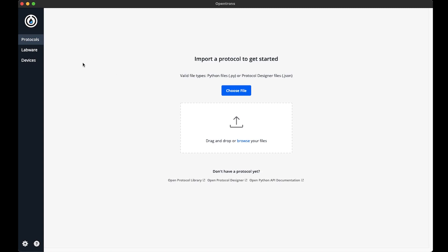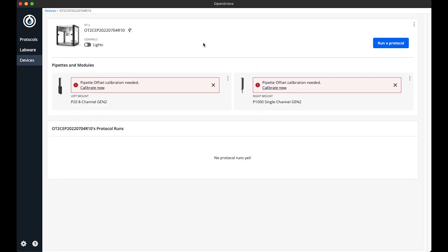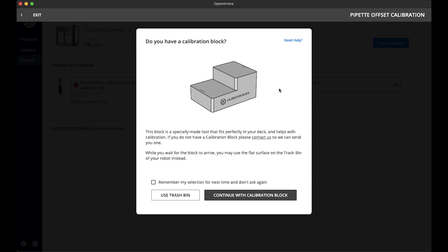To initiate this calibration, I will navigate to the Devices tab in the Opentrons app and select the device I want to calibrate. Since I haven't calibrated the pipette offset or tip length calibration yet, there is a banner asking me to do so. I will click Calibrate Now. When you first calibrate the tip length and pipette offset, the robot will ask if you want to use the calibration block. If you don't have one, you can use a trash can, but since I have a calibration block, I'm going to use that. I'll also click 'remember my selection for next time' and continue with the calibration block.